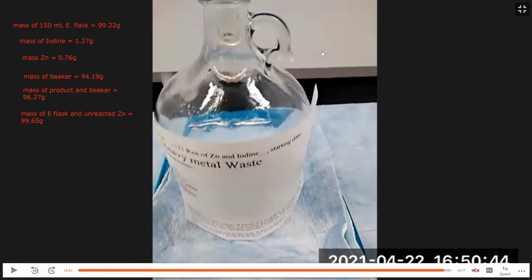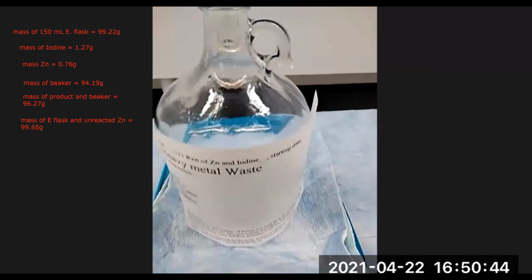So the first thing we want to do is calculate the mass of unreacted zinc. That's going to be the mass of the Erlenmeyer flask and unreacted zinc minus the mass of the Erlenmeyer flask empty.